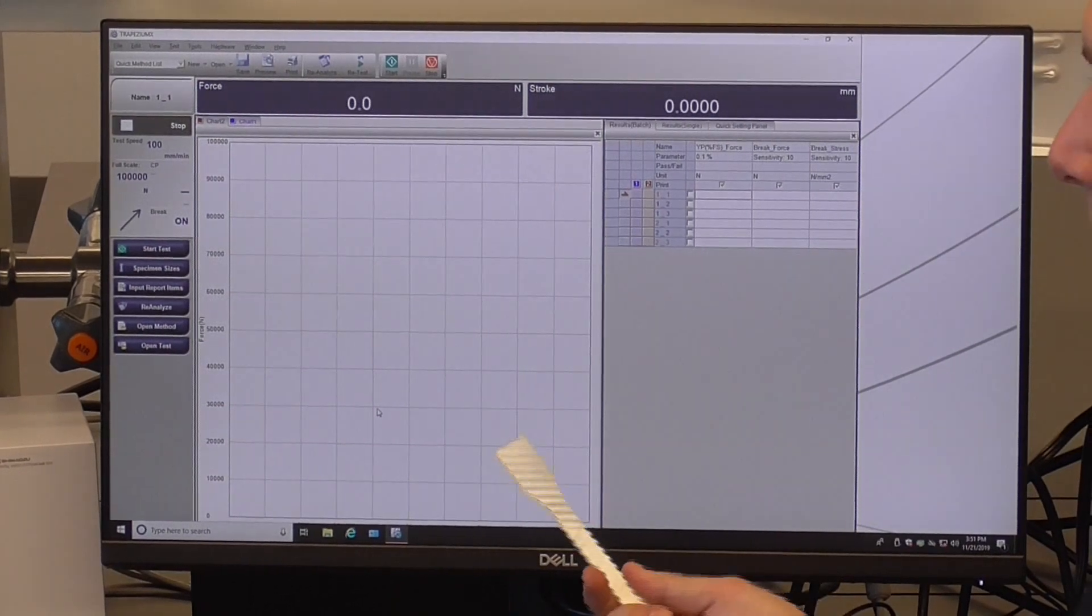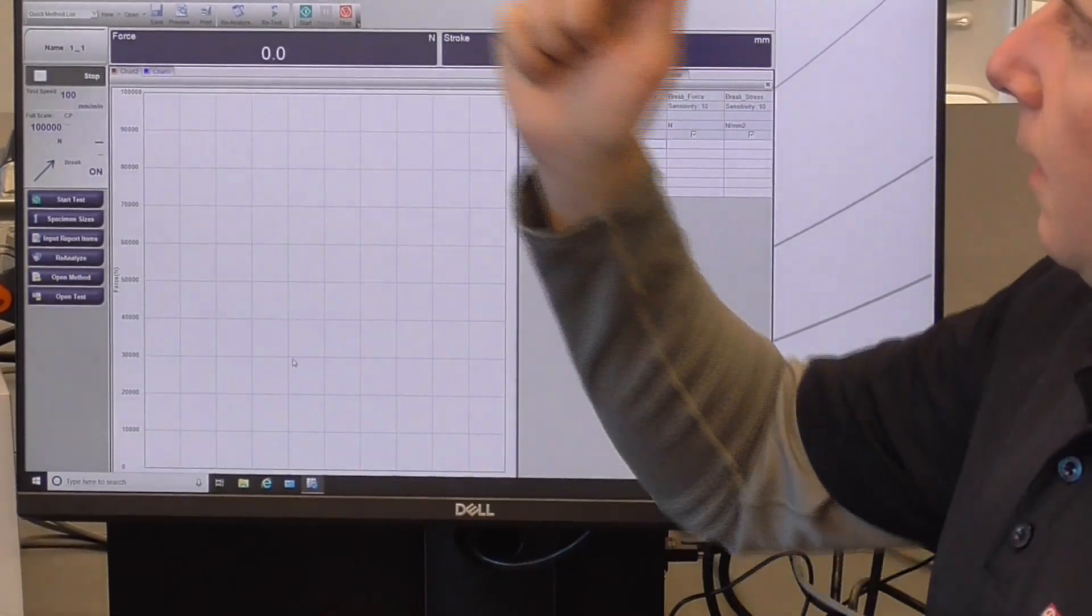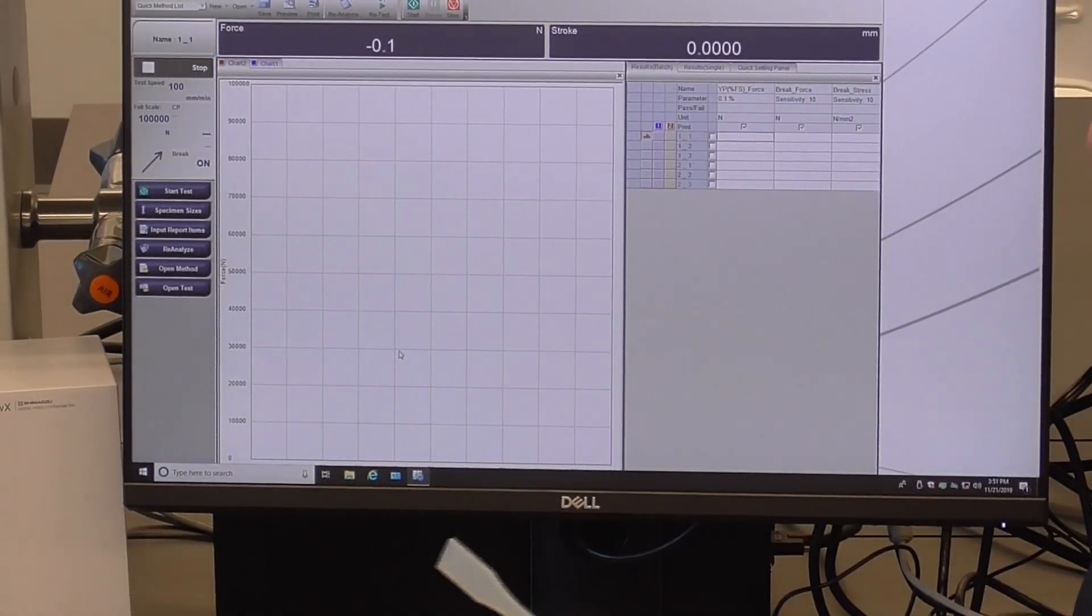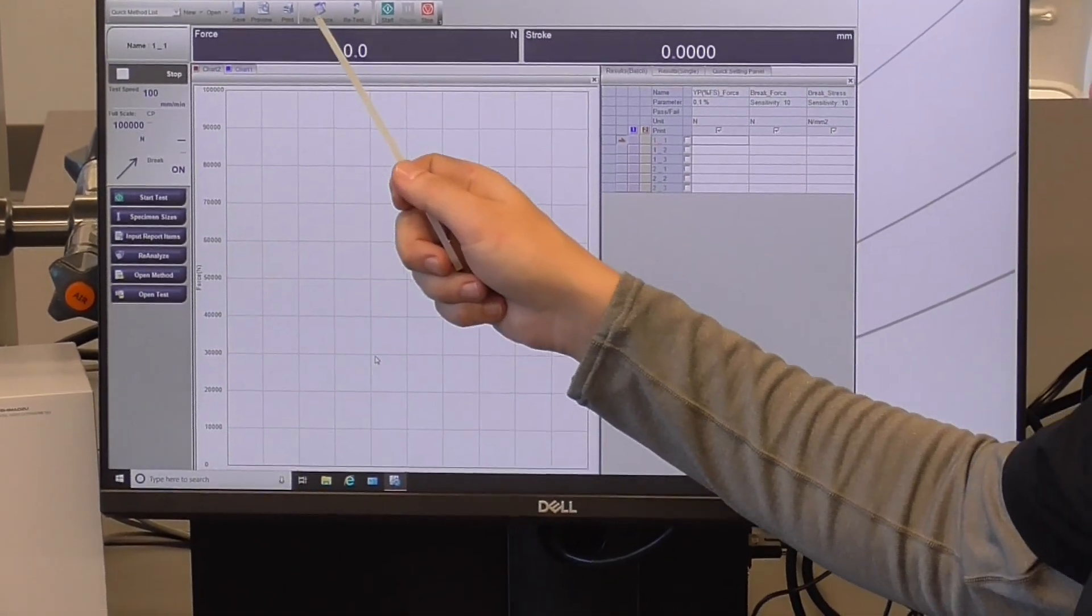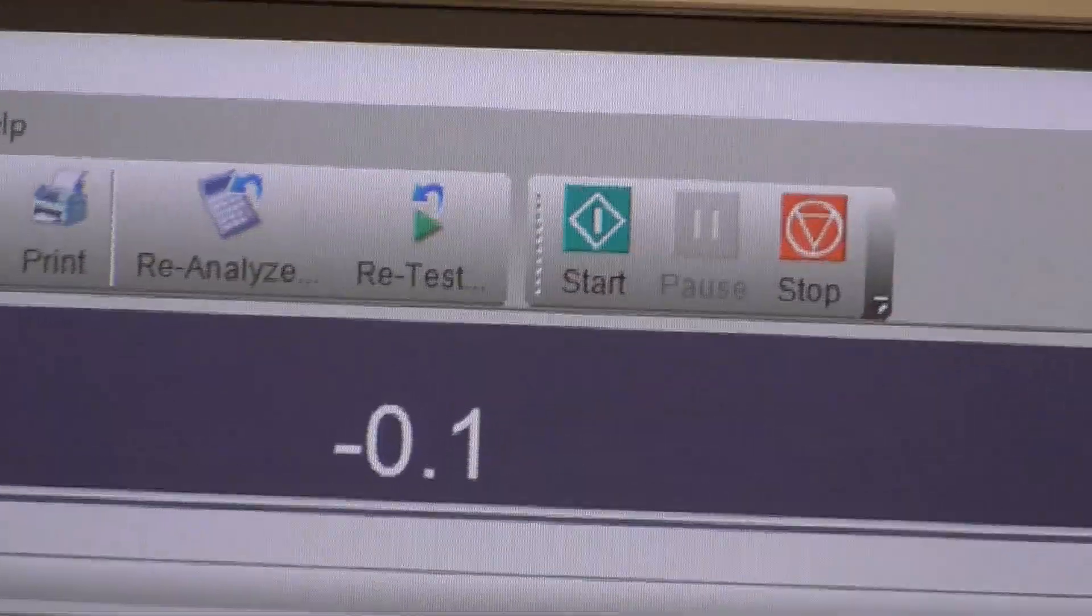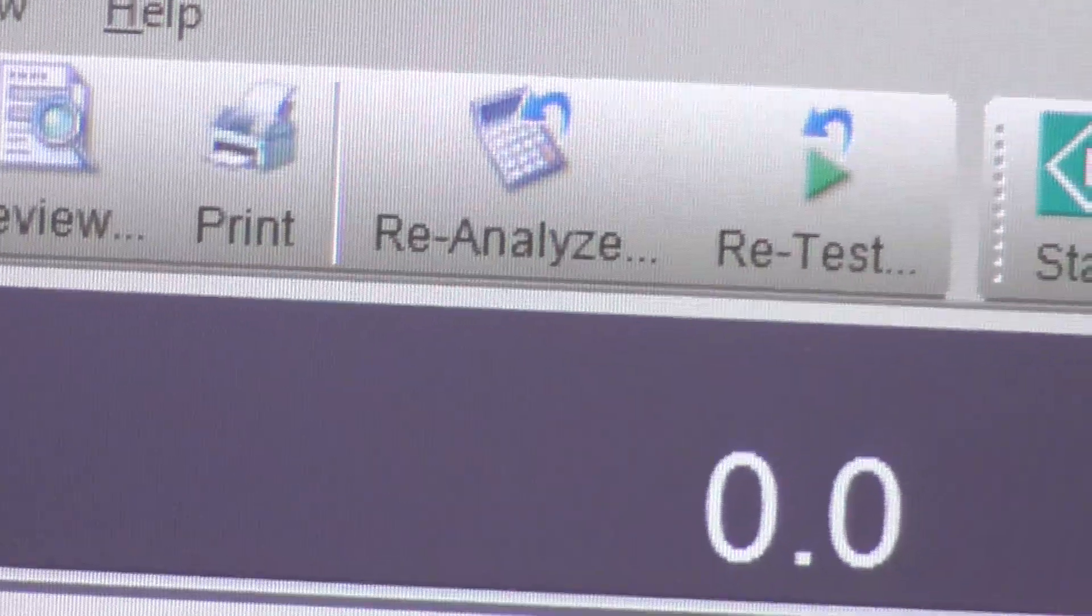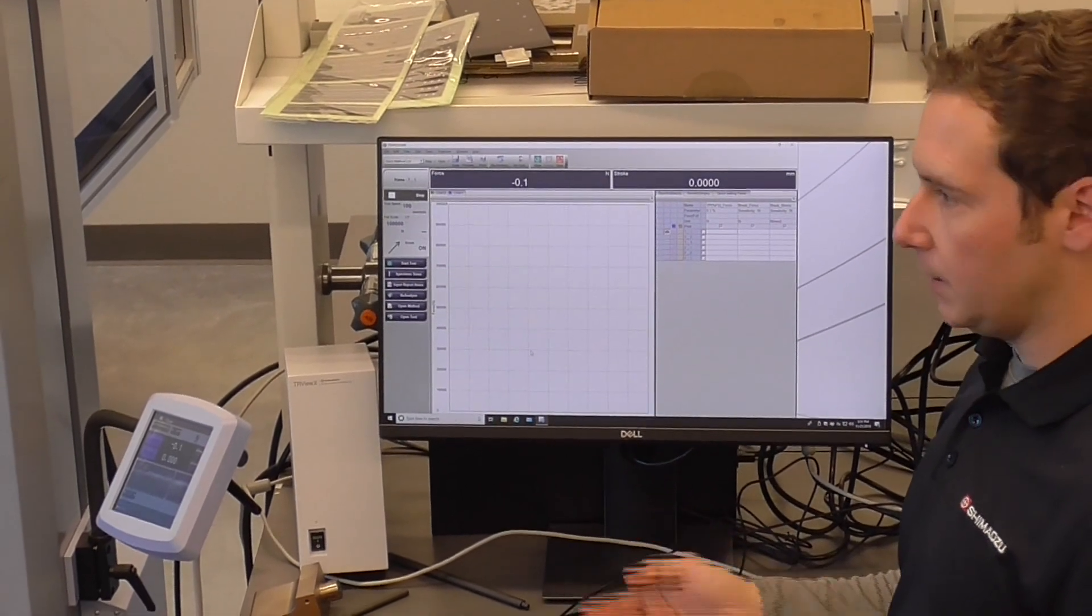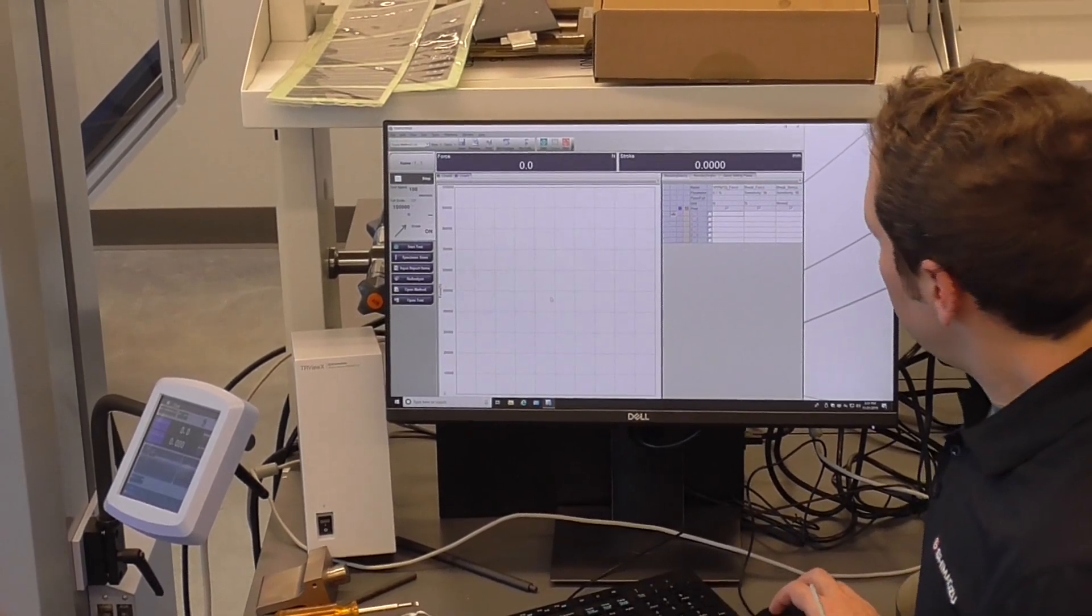Lastly, something to kind of note is that going back to what I've been kind of repeating is that the only thing that's kind of taken from this frame is the force and the displacement. Everything else is a calculation. We have a reanalyze function. So, just say you ran a test. You forgot to put a certain data processing parameter on there. You can go back using the reanalyze function. Add that data processing parameter in there. Finish that method. And then it will apply that data processing parameter to test data that you've already written. So, that applies to a test you may have just ran. Or a test that you ran months and months ago that you still have the data for. So, just load it up in here, do a reanalyze function, and get whatever data processing parameter that you want.